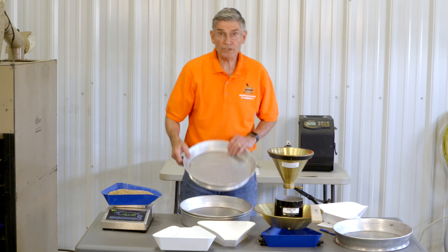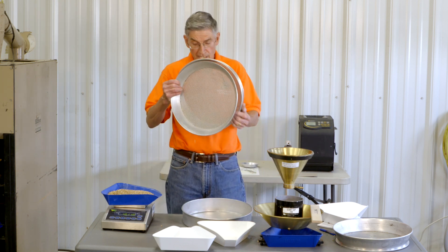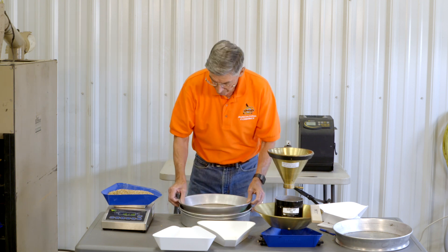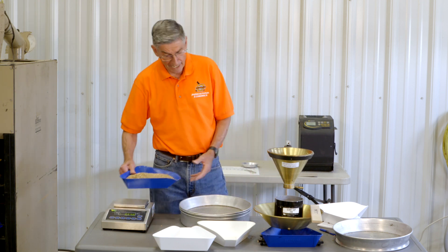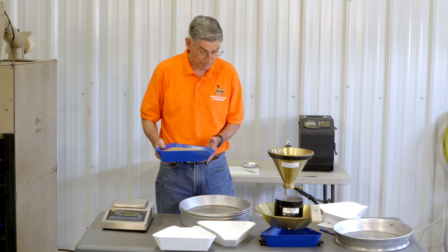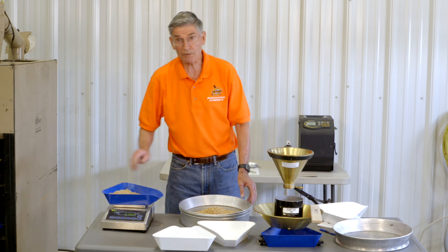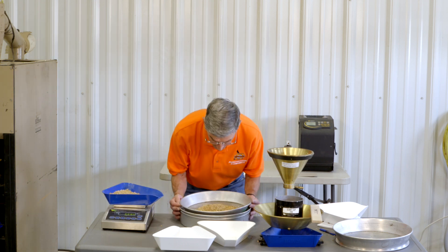I want to use a 12-sixty-fourths embedded over a 5-sixty-fourths round hole sieve to remove the dockage. I want to do about half the sample at a time — this is relatively clean wheat. If it had more dockage, I would probably do a third of the sample at a time.